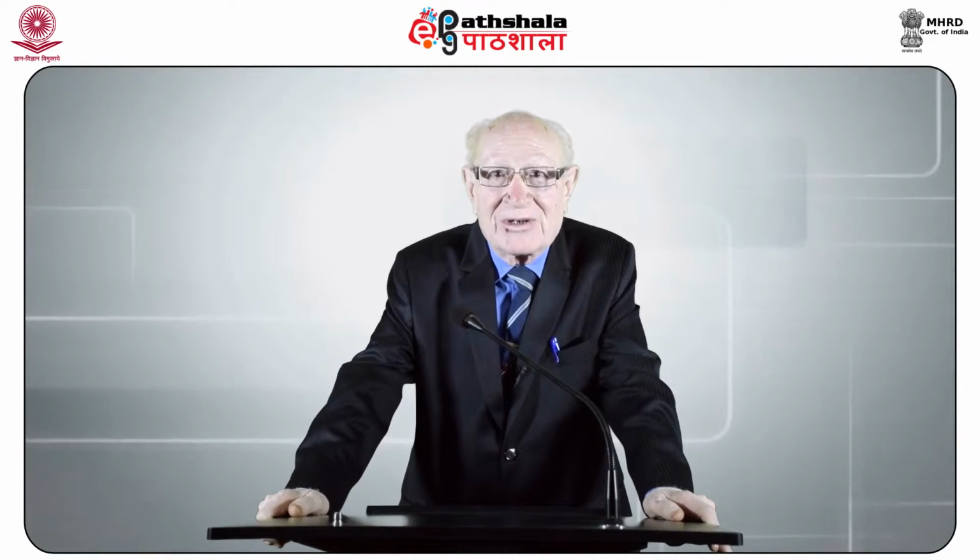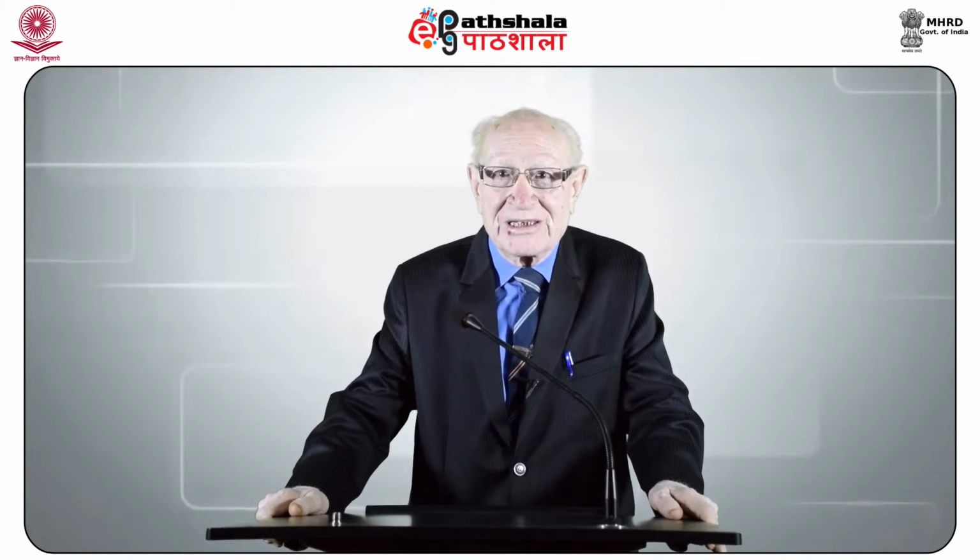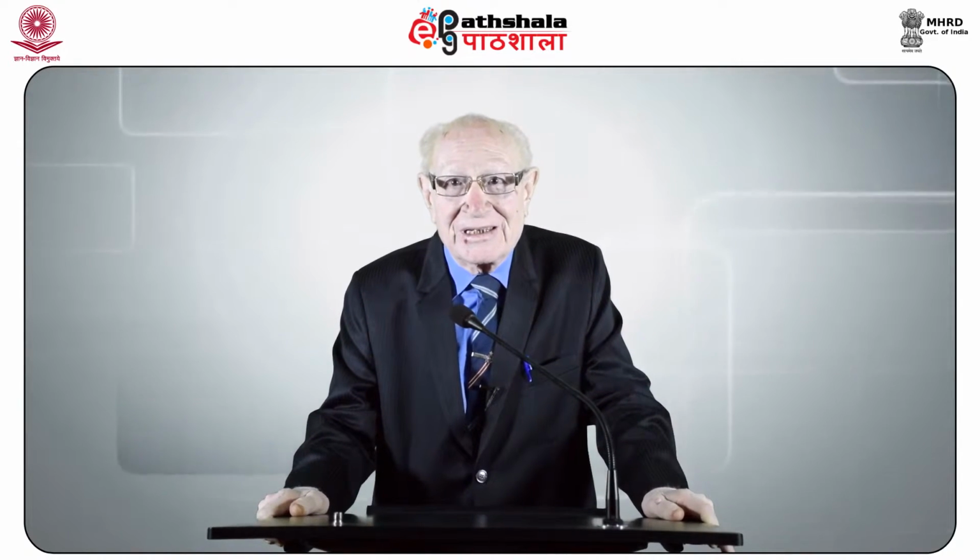The method involves the use of an electron microscope, which has many advantages over the other methods because we can photograph the GSR particle up to a magnification of about 2 lakhs in the case of a scanning electron microscope, which has not only high magnification but also greater depth of focus and is most useful for the analysis of GSR particles.